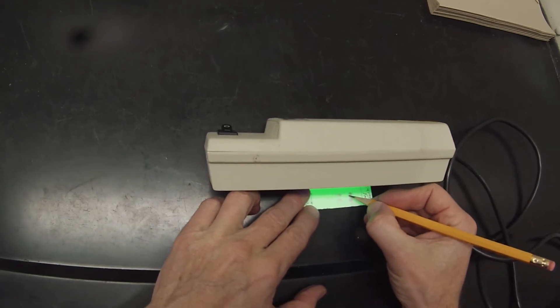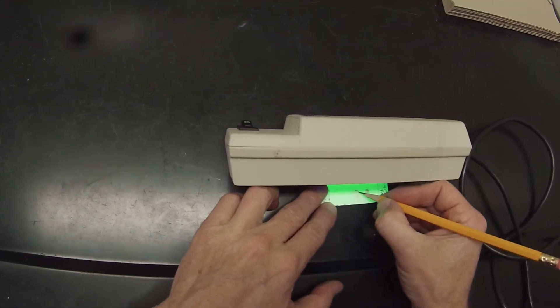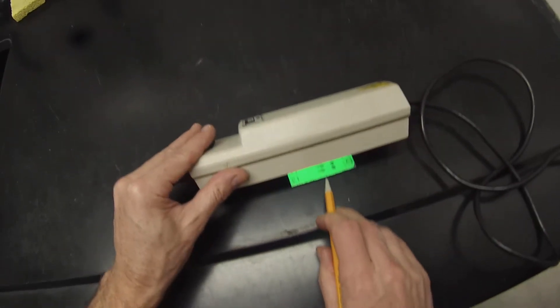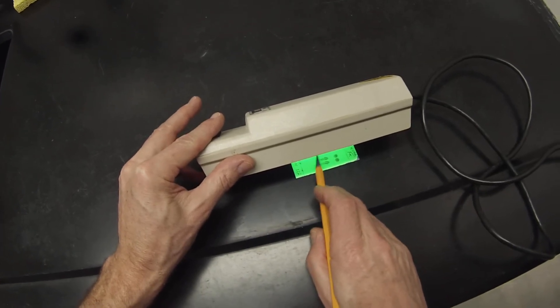So our biphenyl actually hasn't moved all the way up — that's good, assuming that's the biphenyl. And then we've got probably our alcohol here, the other isomer in the alcohol. Hopefully the ketone will be in here somewhere.